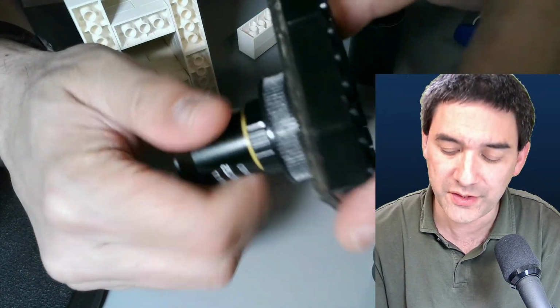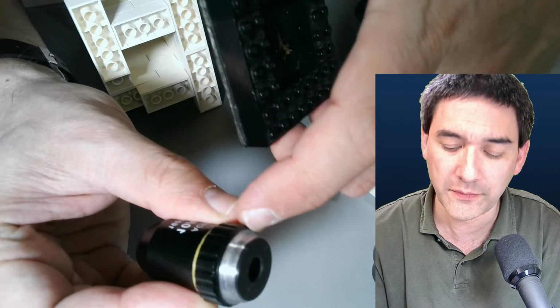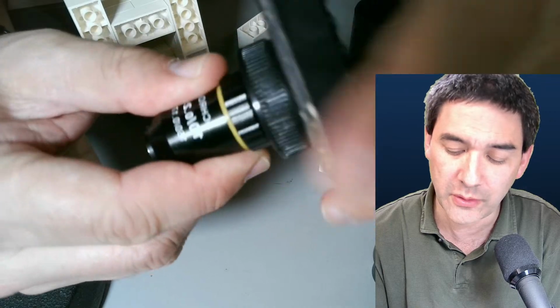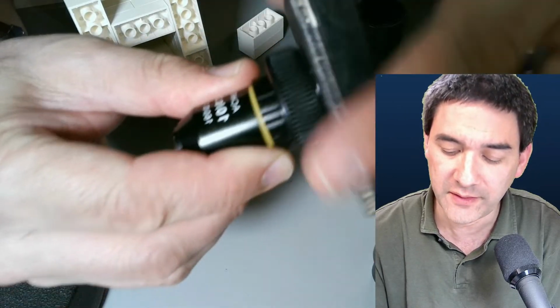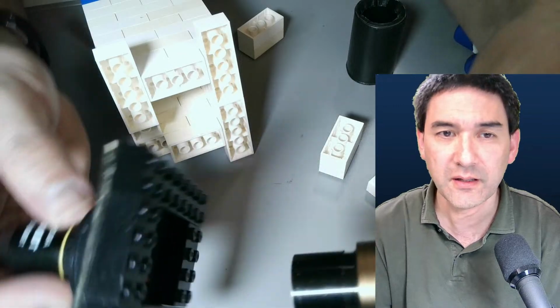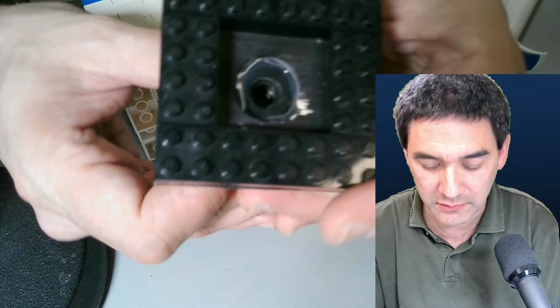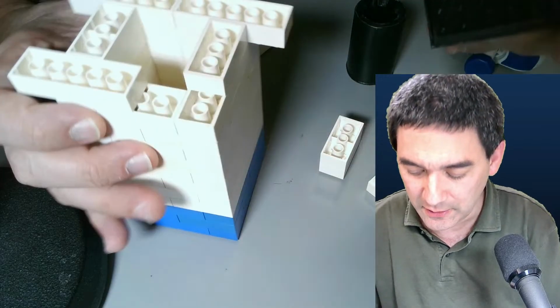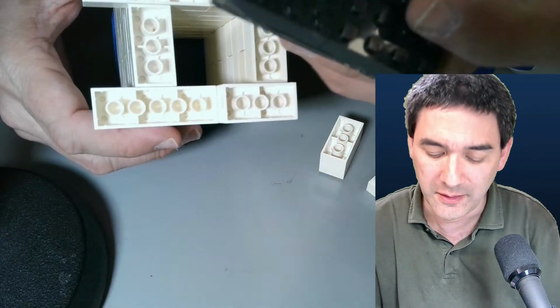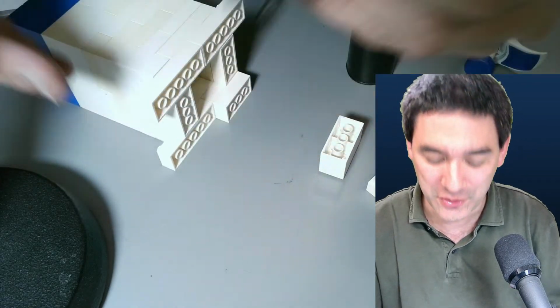Let me unscrew this here. The top part of the microscope objective to the eyepiece. That's kind of the standard, and if you keep this distance properly, then essentially you have a microscope. That's all there is to it. This is, for those of you who are interested, a little bit of a weekend project. I just wanted to show this to you.